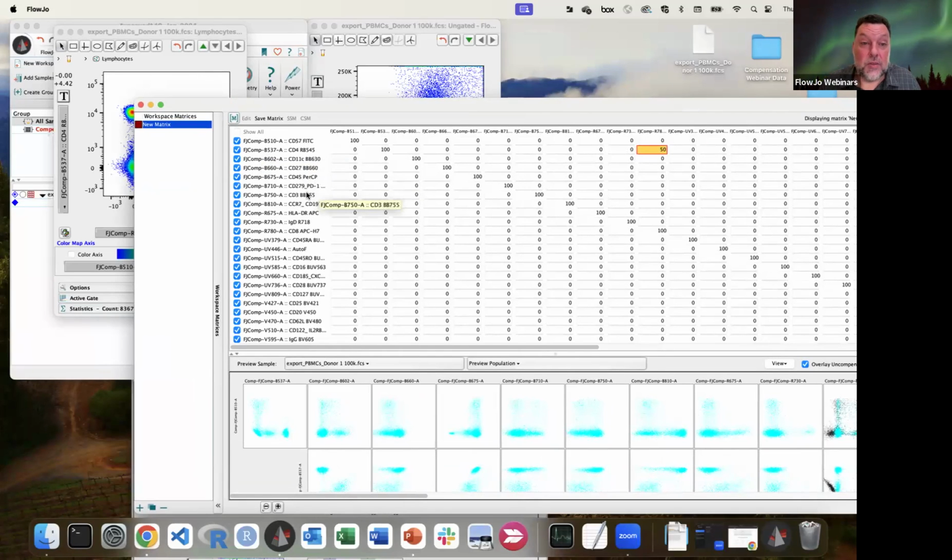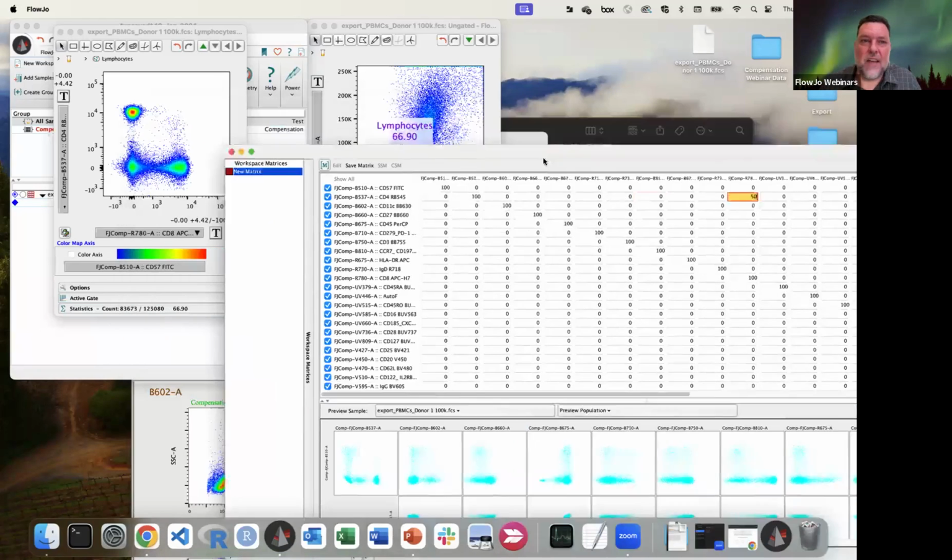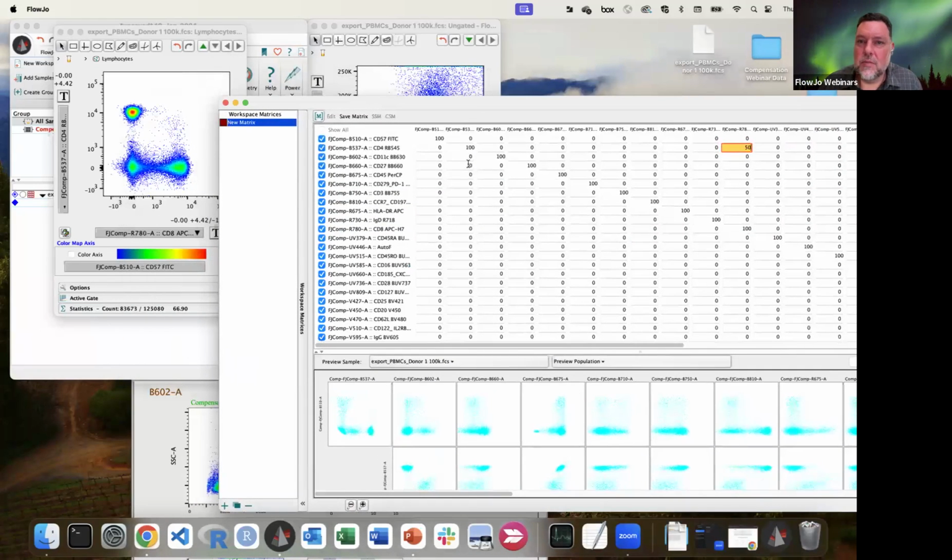But I promise it works, right? And this is what Cytek teaches you to do on an Aurora. They give you a matrix of zeros and say, edit the interactions here. I just haven't set it up properly to give you a good example. But you can put in 25 and then add a negative to it, right? Is that appropriate? Oh, you can see the effect here.